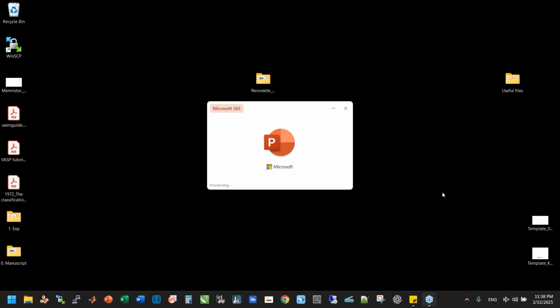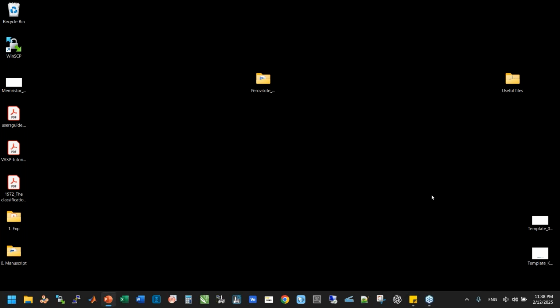So you were saying that the carbon protective layer is there, but it is not really being cut through when you're doing the cut in the FIB preparation, if that makes sense? Yeah, you mean the carbon protection layer on top of the device?